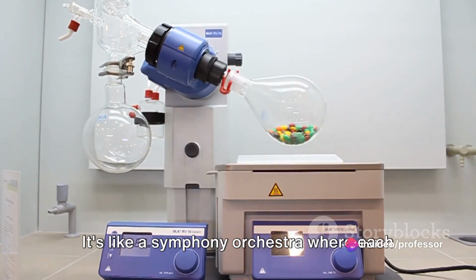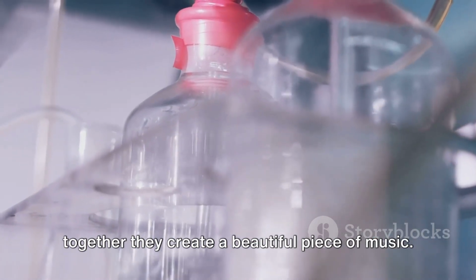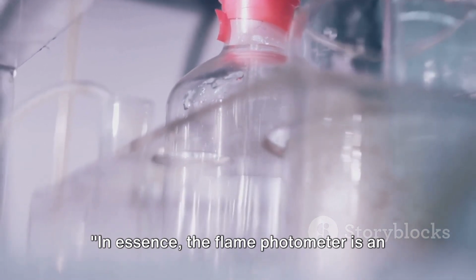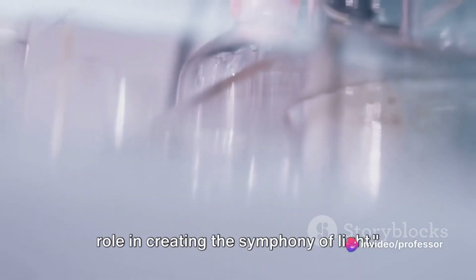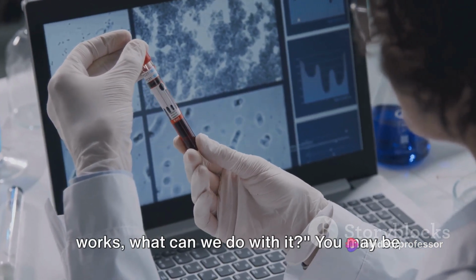It's like a symphony orchestra where each musician plays a different instrument, but together they create a beautiful piece of music. In essence, the flame photometer is an orchestra where each part plays its unique role in creating the symphony of light. Now that we know how a flame photometer works, what can we do with it?